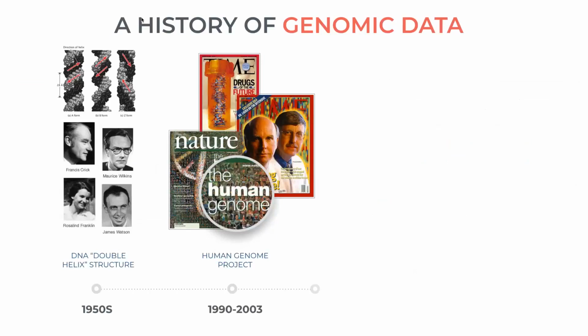And so the Human Genome Project really opened up a lot of those data sets, but it was a transition from a standard sequencing method to a new sequencing method that eventually was popularized by Illumina. And so a lot of times when we say next generation sequencing today, we will be referring to Illumina sequencing, even though other methods are available. And so Illumina really made it much more affordable, but their methodology needs to be understood so that we can properly address the processing of next generation sequencing data.